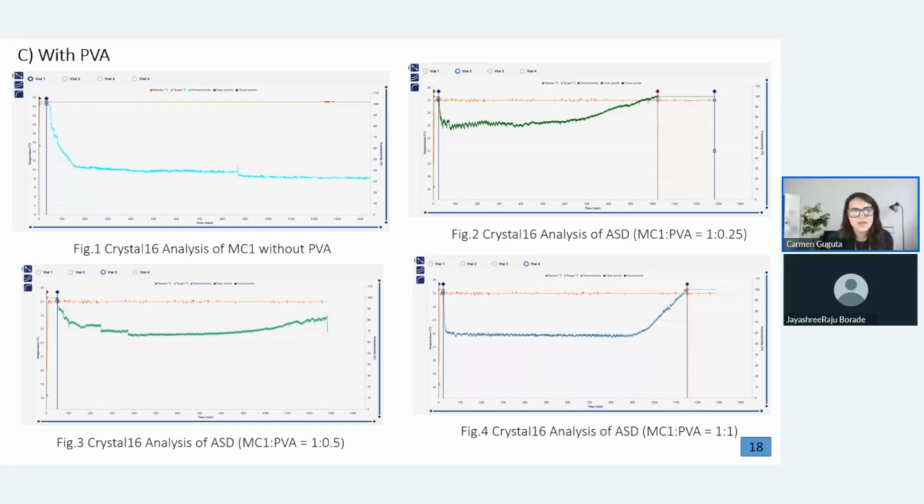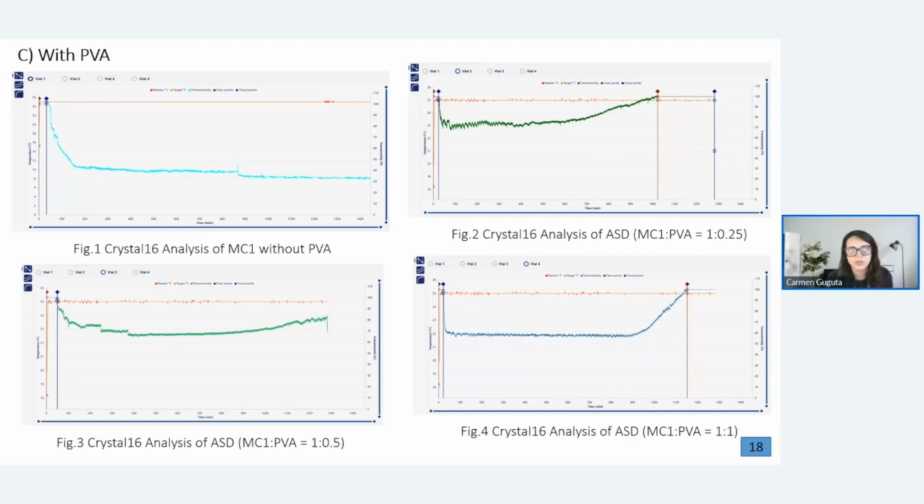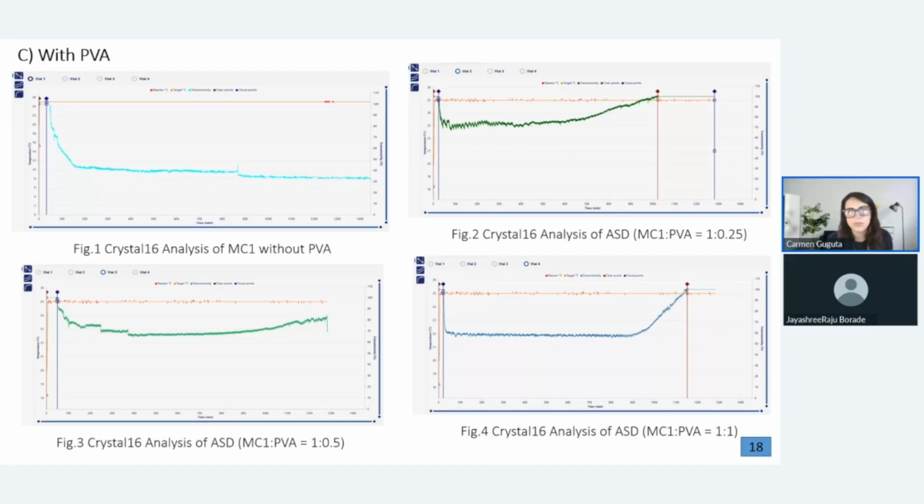Somebody is asking another question not related to amorphous solid dispersions, and says, how would co-crystallization play a part in the future of enhancing the properties of poorly soluble drugs?